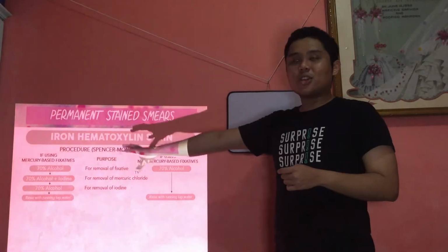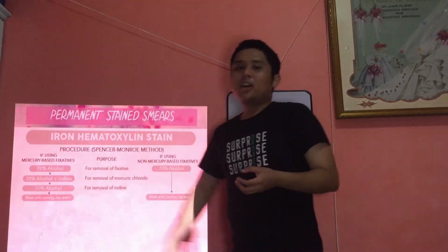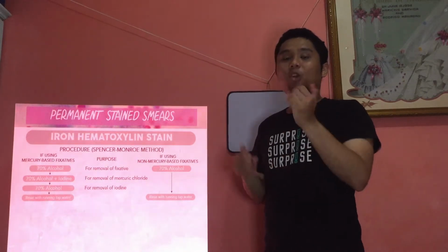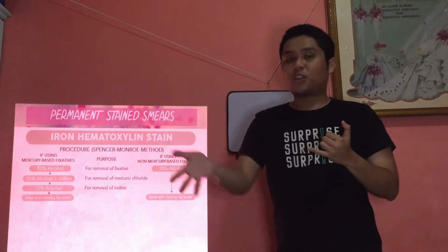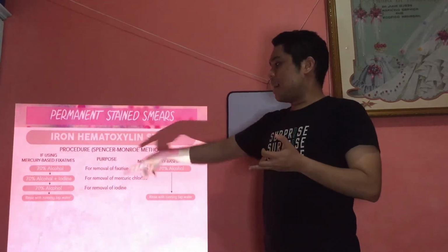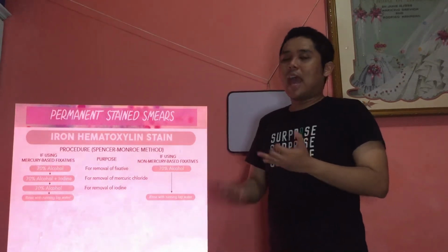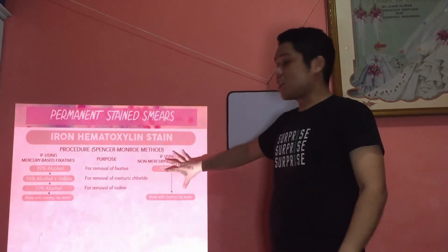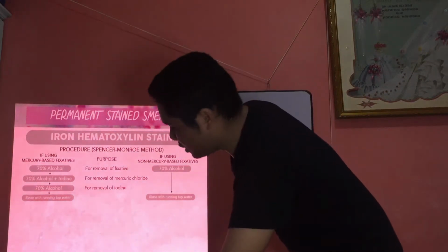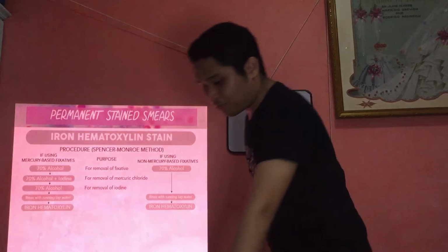The difference for mercury-based fixatives is these reagents. Always remember that the next reagent after alcohol is alcohol and iodine. Why? Because you need to remove the mercuric chloride first. After removing mercuric chloride, you then add another alcohol. Why? For removal of iodine this time. And then the next procedure, same as with non-mercury-based, you rinse with running tap water. And after rinsing with running tap water is the stain itself, iron hematoxylin stain.